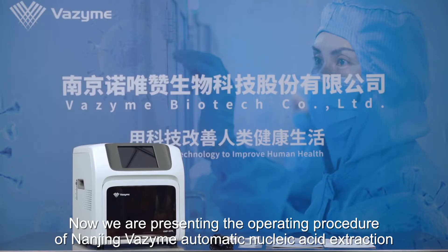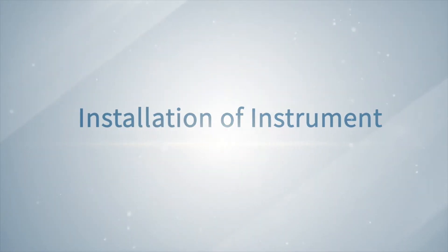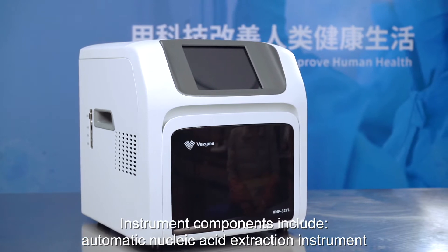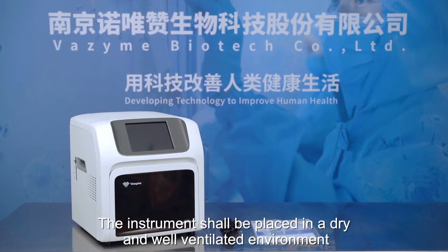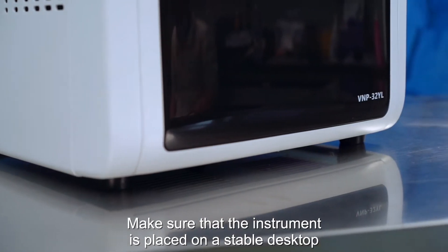We are presenting the operating procedure of the Nanjing Vazyme Automatic Nucleic Acid Extraction Instrument. Instrument components include the Automatic Nucleic Acid Extraction Instrument, powerline, and file package. The instrument should be placed in a dry and well-ventilated environment, and make sure that the instrument is placed on a stable desktop.